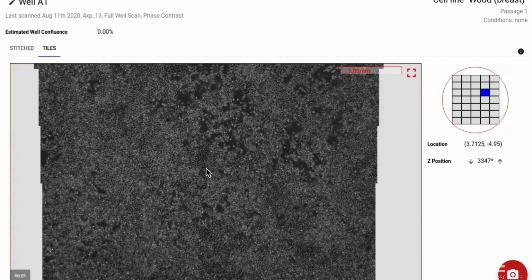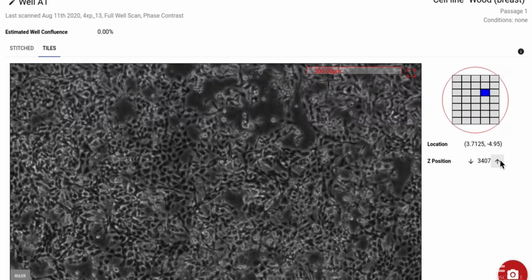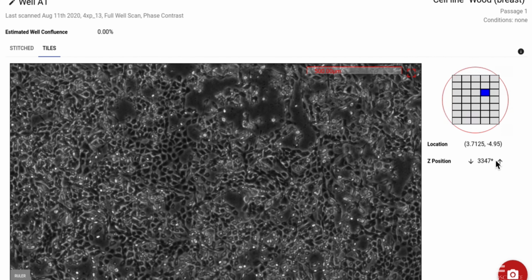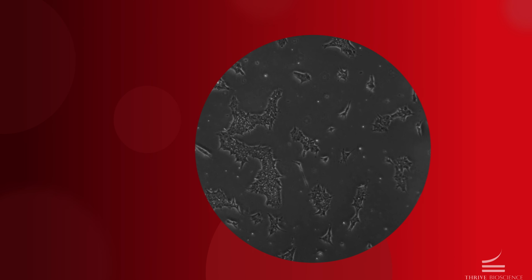As biologists often greatly benefit by later reviewing their samples at different focal planes, CellAssist gives you the option to review and zoom into any portion of any well and to reselect any of the different focus increments at any time, now or in the future. And CellAssist's advanced imaging algorithms provide clear, precise imaging across the well every time, ensuring accuracy and repeatability. Your work is always saved and can be revisited at any time.